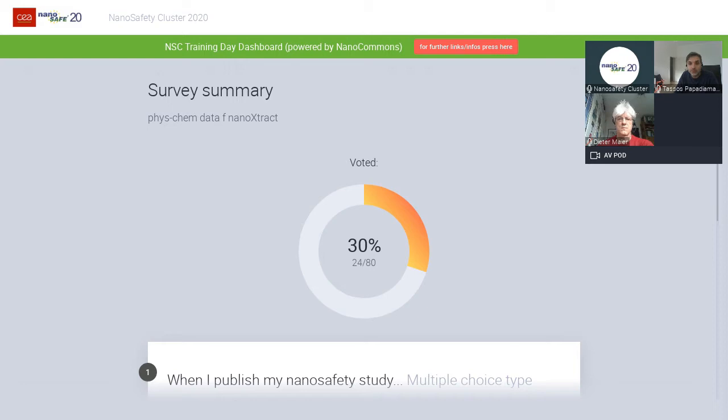Of course, the intention is to use a software in an objective way to be able to determine nanodescriptors, maybe quite extensive nanodescriptors, from your TEM images, and to do this then also in a way that you can upload data and provide it to other people that could build on that. So I guess with this, we would like to start. Thank you very much for giving your very frank and open answers to that. And I switch to the presentation of Dieter. Or even better, he goes into the screen sharing.